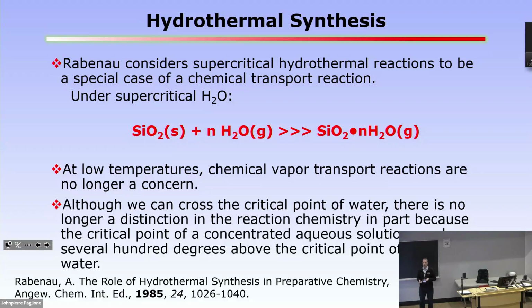The thing is not so much to think about the critical point of water. The thing is to think about the temperature, the volume, and the pressure, and to use the appropriate autoclave for the process.